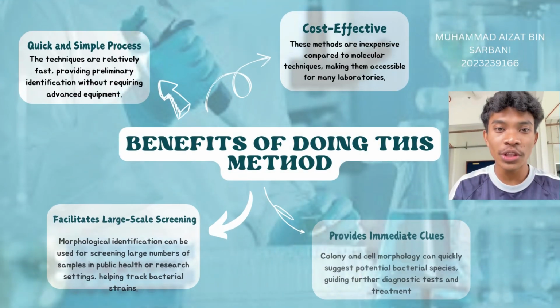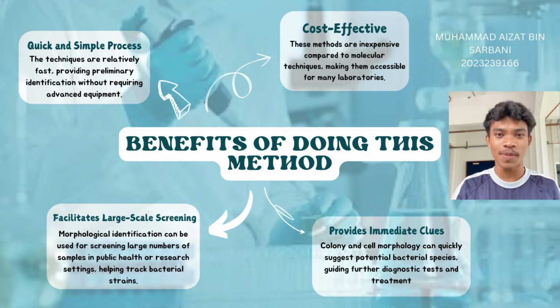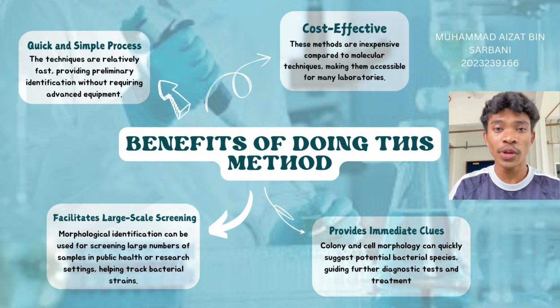Now, I want to tell you the benefits of doing this method. Firstly, it's a quick and simple process. The techniques are relatively fast, providing preliminary identification without requiring advanced equipment. Secondly, cost effective. These methods are inexpensive compared to molecular techniques, making them accessible for many laboratories.